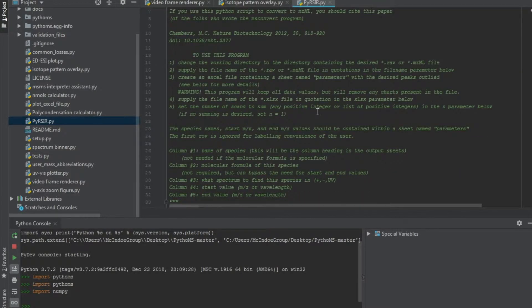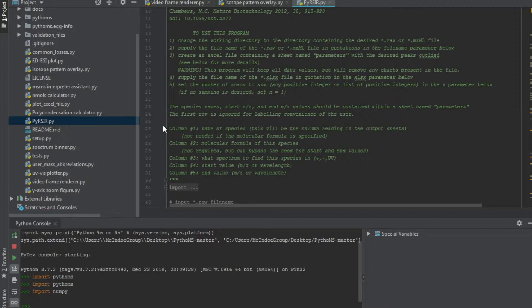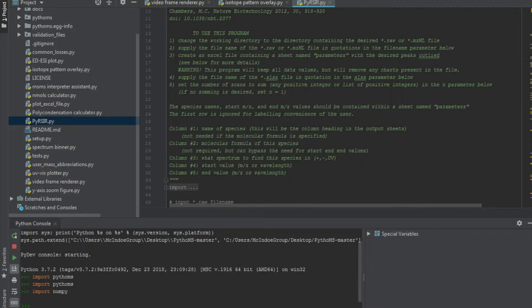If you ultimately cannot download or use ProteoWizard on your PC, you can check if the PC connecting to the mass spectrometer has the software. Chances are there usually is, and you can convert it directly there.